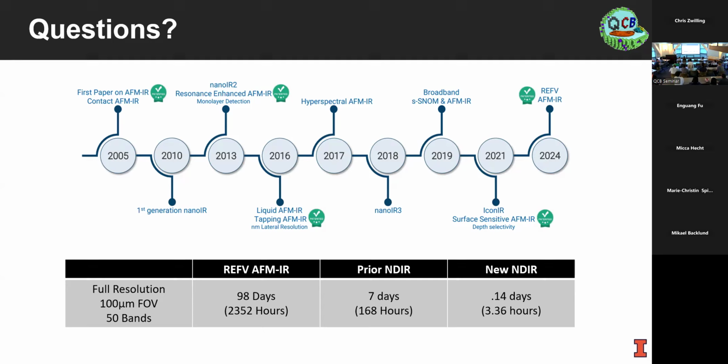I'm just wondering, people who do tomography also have to do FIB milling. And they can get those, they vary, but it's typically around, I think, 200 nanometers. You could mill it even more closely. You could almost think of milling through the cells and then you look at each of those layers. Yeah, you sort of pointed that way in one of your earlier slides, milling it down, imaging. Yes, mill it. Yeah, that's one way.